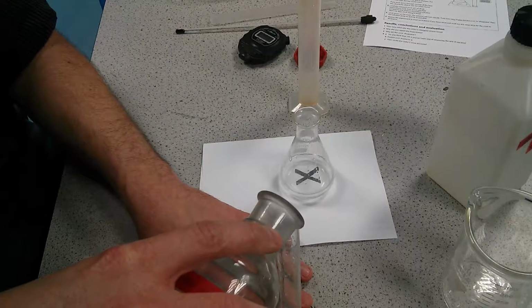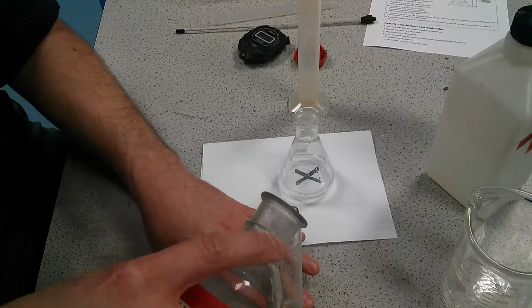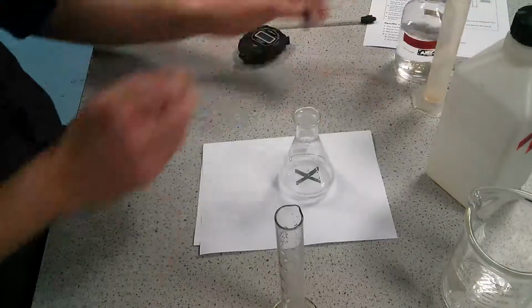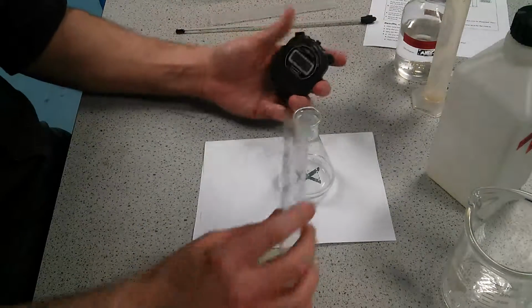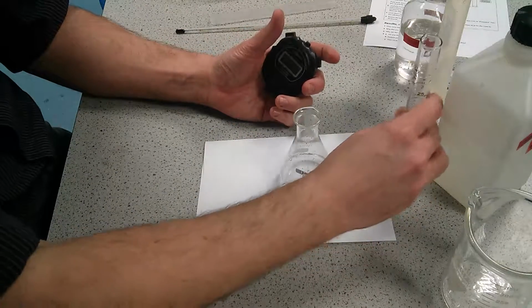And this can be done so one person can be measuring out the acid and one person can be measuring out the sodium thiosulfate. Remember, put the top back on. Then what we're going to do is we've got a stopwatch. We pour it together like so and we start the stopwatch.